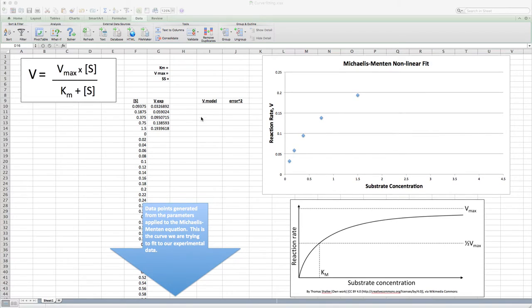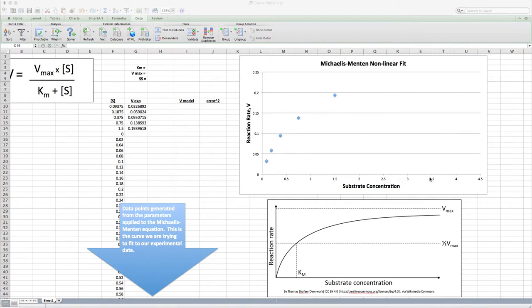Let's now estimate these parameters off of our graph as we have it right now. And so we could estimate our Vmax from this curve. It'd be really nice to have a data point here at 3%, but in my experience, with 3% in my filter paper discs coated with the yeast catalase, the reaction goes so fast that the discs don't sink to give me a chance to actually time the rise. So that's very fast, so I can't get a data point here. I have to deal with just these.